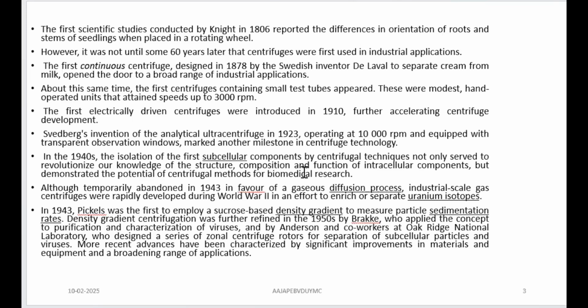And it is not just a simple common centrifuge, but it is equipped with an observation window. Can you imagine, the centrifuge is working, the tubes are kept in it, the centrifuge is running, particles are settling, but there is a window through which you can see the particles settling. Real time monitoring of the settling particles can be done. Of course, no need to put your eye onto it. You can attach microscopes to it, you can attach analytical instruments like a spectrophotometer, and monitor the particle settling in terms of their properties, right?